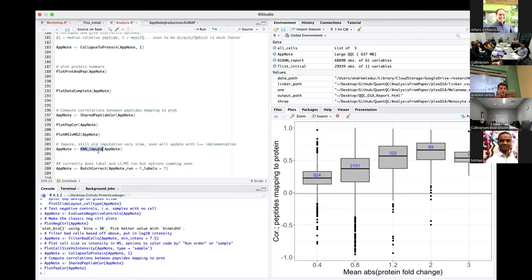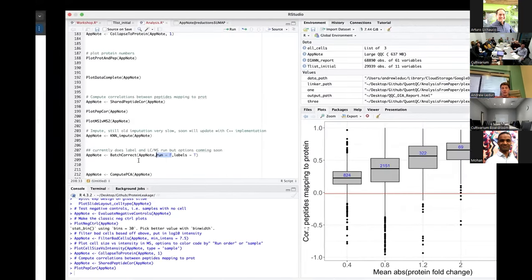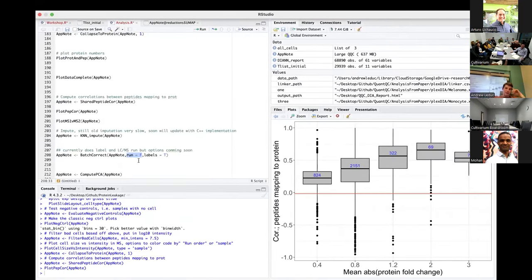So here's the imputation function. You can batch correct on labels. There's a couple options here. Run would be to correct on every single run, which you certainly do not want to do with plexDIA style experiments. In the past, this was implemented before I implemented the spline fit that I showed earlier, so it's probably always going to be false.